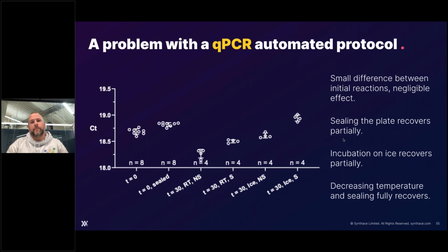So in order to prevent evaporation leading to a systematic error in the qPCR assay, we recommend keeping stocks cold and sealed during the protocol, or indeed splitting the amounts of runs up and executing the assay as quickly as possible to prevent this effect.